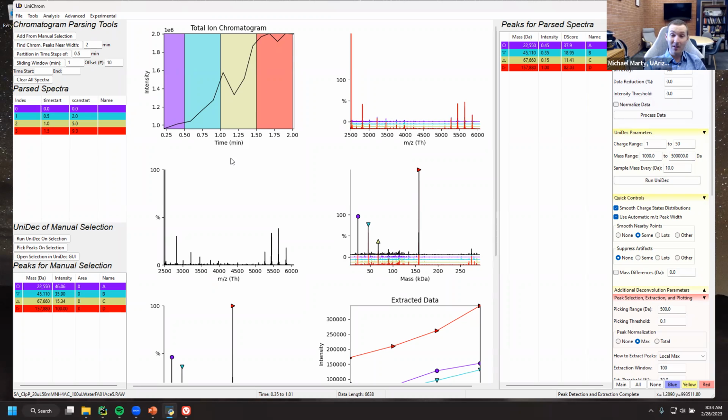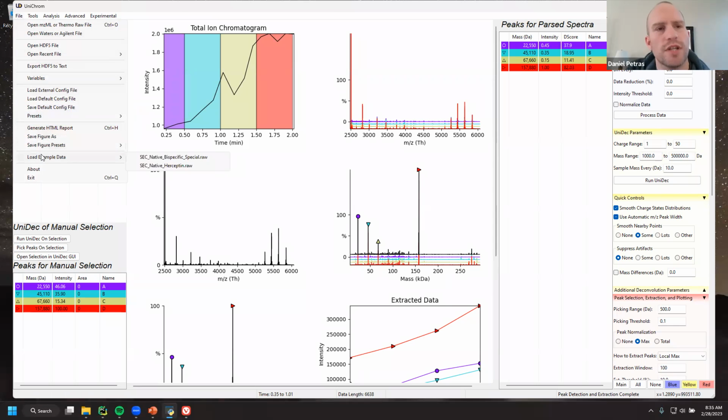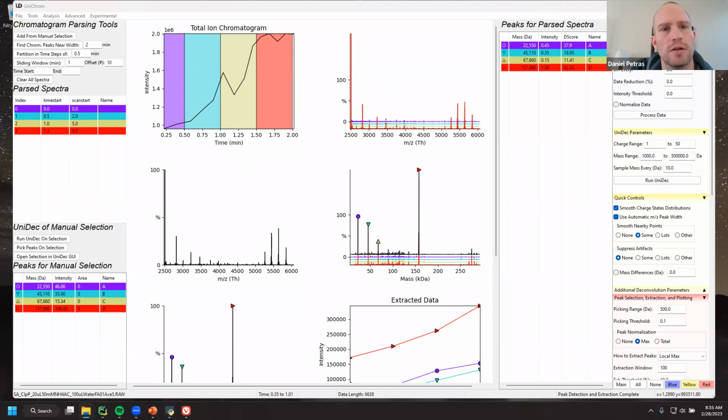We're working on developing an imaging workflow. It's based on the same thing. For the imaging runs, we have about 1,200 to 2,000 scans. We just use some clever thresholding to cut out some low abundance stuff, and it works pretty quickly there. Let's try it. The imaging is from DESI data?